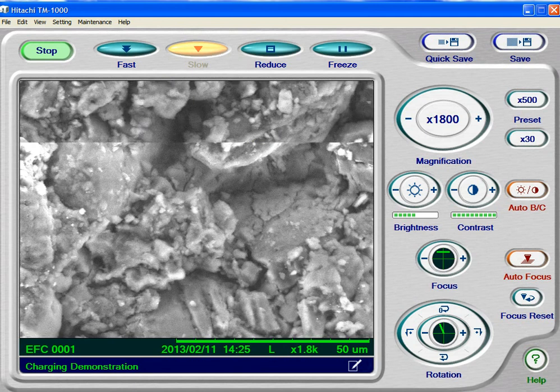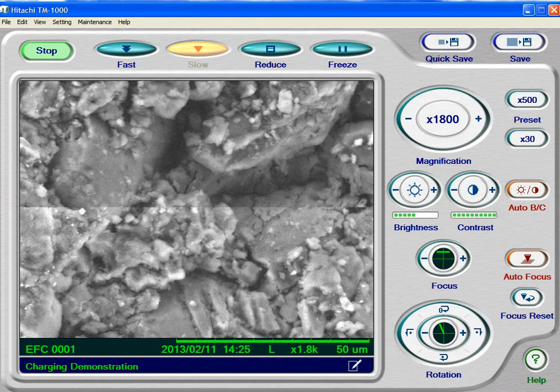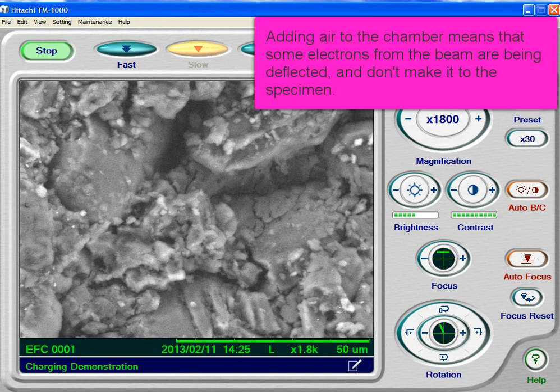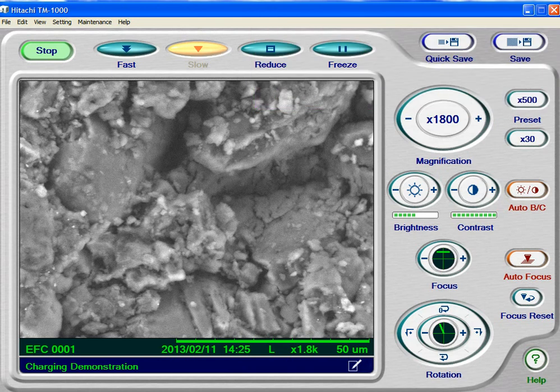So, why not use the charge up reduction mode all the time? Well, because the picture is a little bit more grainy — we introduce a little bit more noise when we do that. But this is charging and how you deal with it. Now, on the big scope, as you'll find out — the S3400N — you can control the atmosphere very finely. You can find that magic little point where the specimen won't charge, but where you also have the least amount of noise. Alright, so there's charging and how to deal with it.